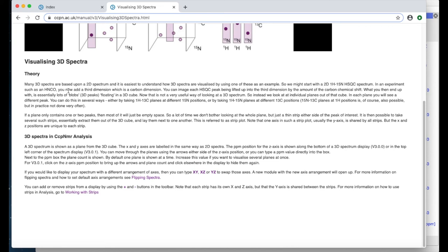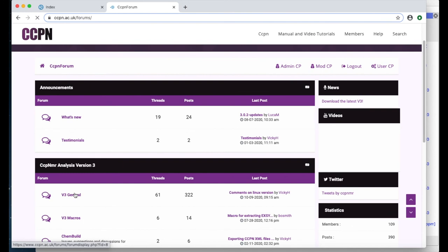We've also got a link to our forum here which is where you can ask questions and we try to monitor this regularly and get back to people with help.